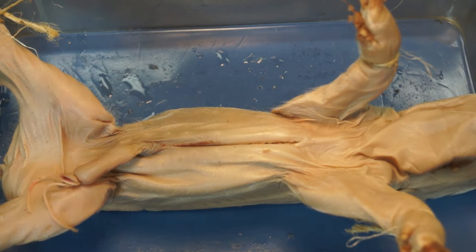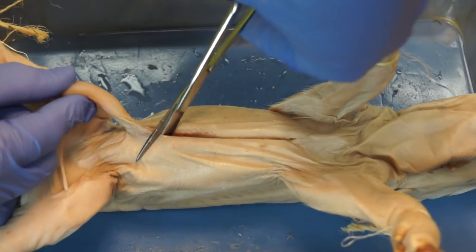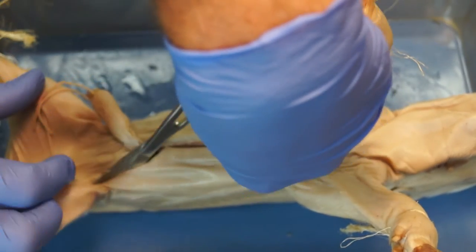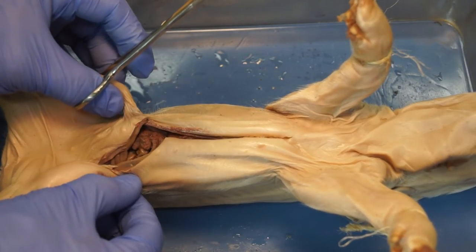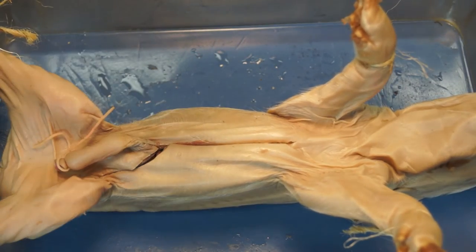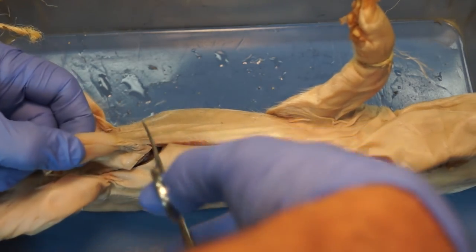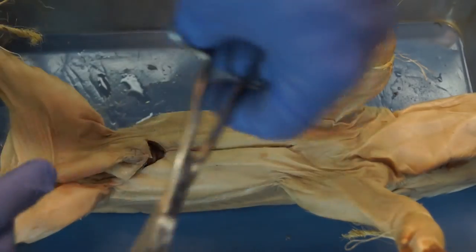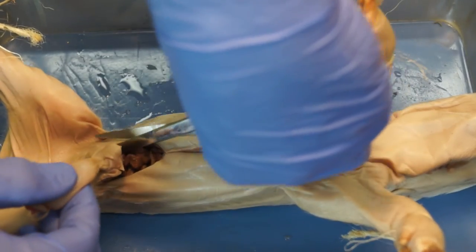The second cut can be done with the scissors by holding up the umbilical cord and cutting around and down towards the junction where the legs attach to the body. You can always expand those cuts later, and do the same on the other side. Be careful so you're not cutting any organs inside.